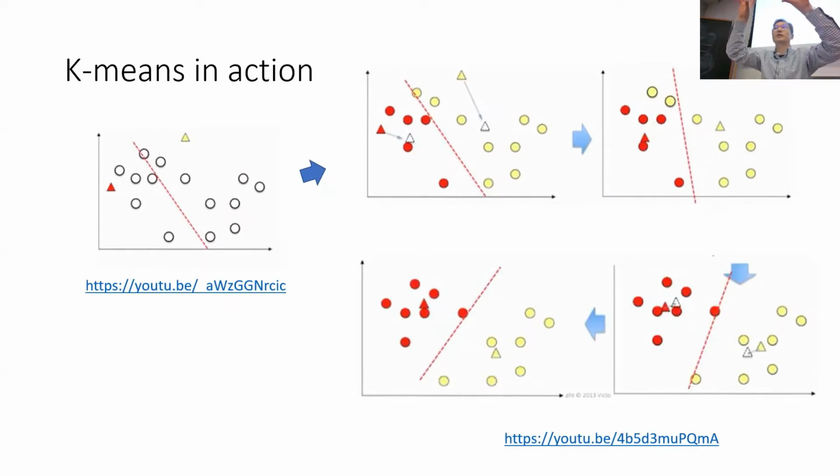We don't know them yet, but at the correct resolution, the same cell types, like B cells, T cells, and macrophages, should be grouped together. That grouping may not be so obvious, just like the example here. Then we use a clustering algorithm to help us make them into small clusters.